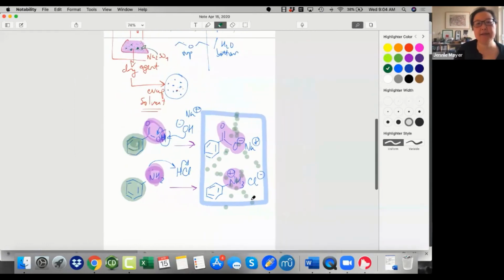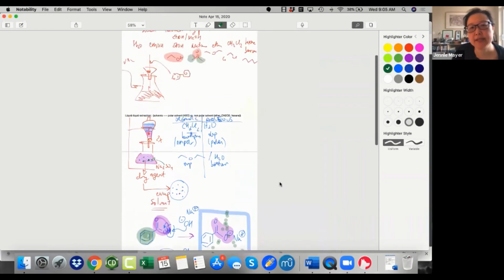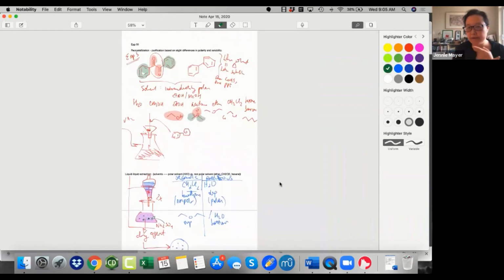All right, the reason why I'm walking through all this is because you need to detail to me a separation and purification scheme for how to separate 3 compounds. And you need to use these ideas at both a theoretical level and also a hands-on practical level. Like, what's the procedure? You want me to mix this with what solvent? How much of it would you use? When do I do the filtration? What compound is the precipitate? You need to walk through a theoretical example of that.